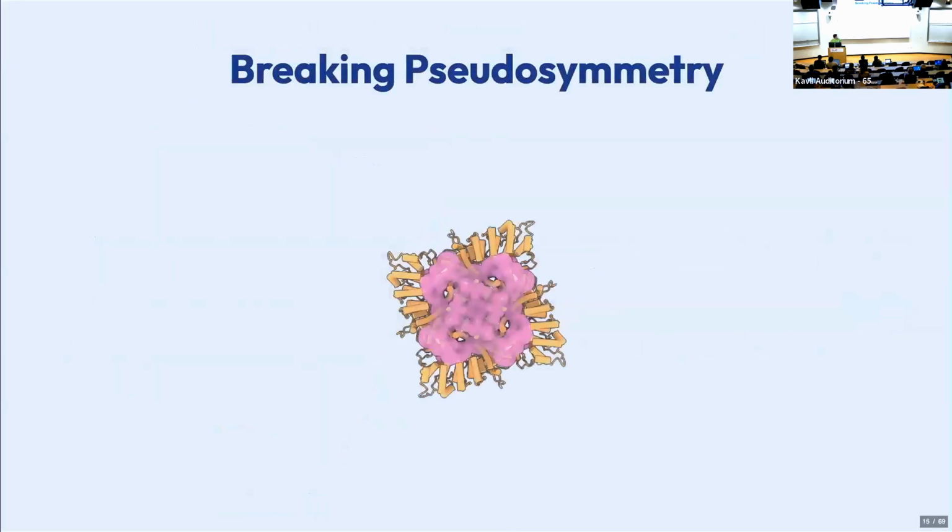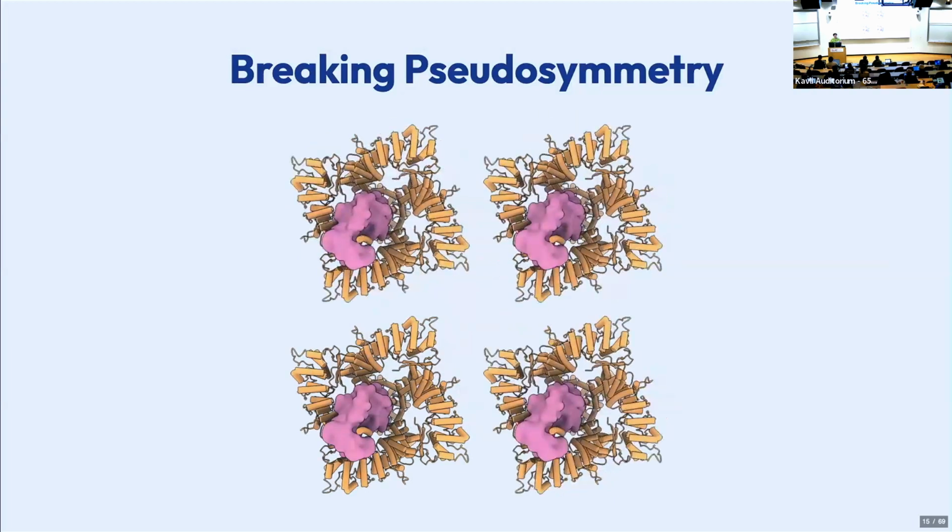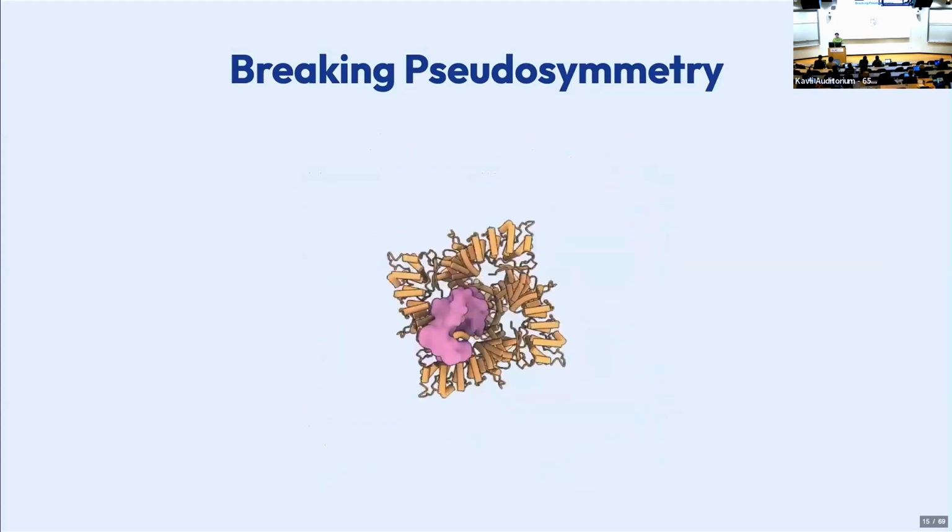What we have is this situation where our particles are kind of aligned in this random orientation and we need to break them apart and fix them. So we could try and do literally that, right? We just spent all the time before lunch talking about classification techniques. Maybe we can classify these particles into the four symmetry-related positions, right? We can put all the ones that have top left in one class, all the ones that have top right in another class, et cetera, et cetera. Then we can independently rotate all of those classes and the particles in them, right? That's the key, so that they're all in the same registration, and then put them back together and refine them, having done this kind of classification and then declassification, right? So let's try that.